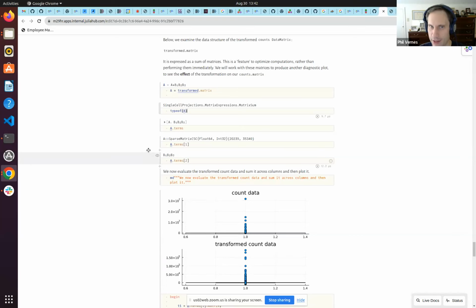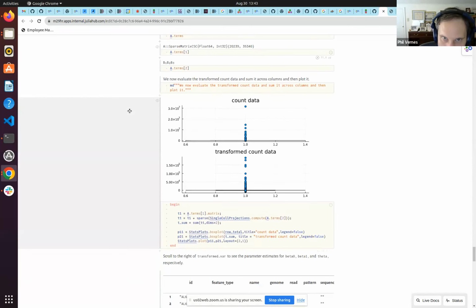But this actually is kind of important if you want to stop and evaluate something or examine it, which I kind of do here. You have to know that you have to break this down. You're not really meant to do that though, but you can. If you're going to, just know that the typing is a little novel. Misha, any questions or not yet? I'm just gonna keep going.